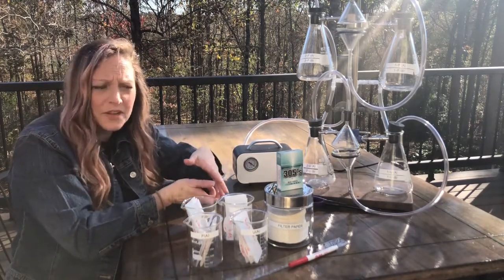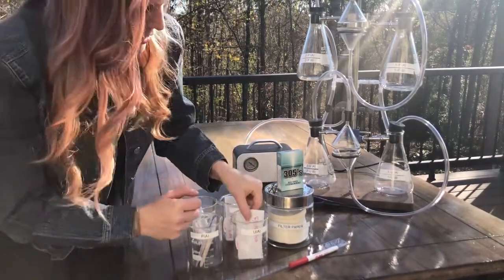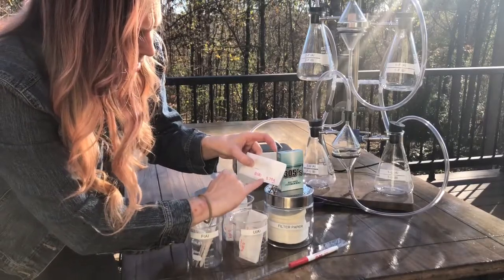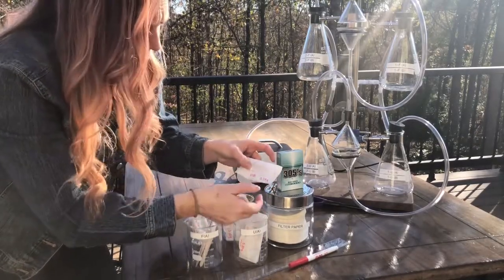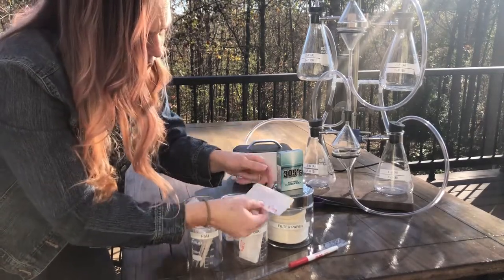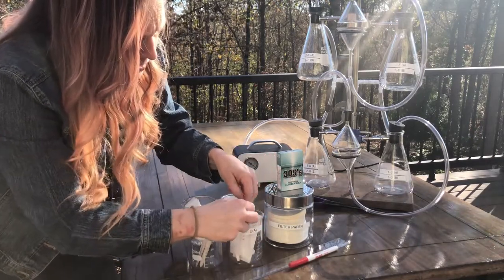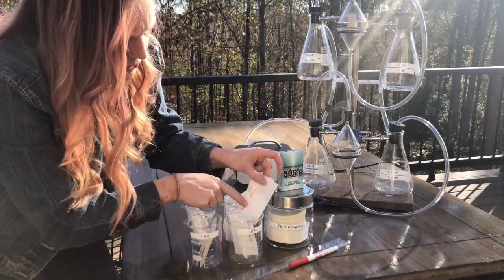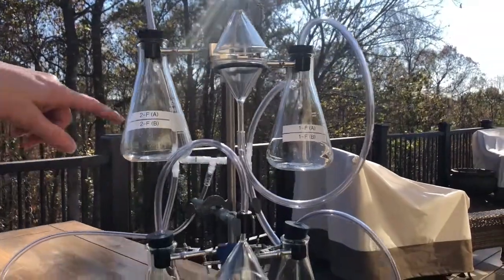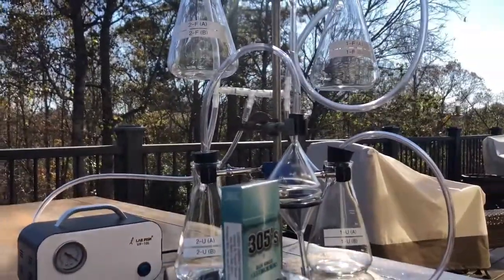I'm going to show you what we have in the beakers first so you know what we're using. So, first things first. This contains our unfiltered cigarette, and I have pre-massed everything so that we can just get the mass after we've run the experiment. Each of these beakers contains, like this one's an unfiltered cigarette, there's the mass on it. And then these are 2 filters, and it's the same for each one.